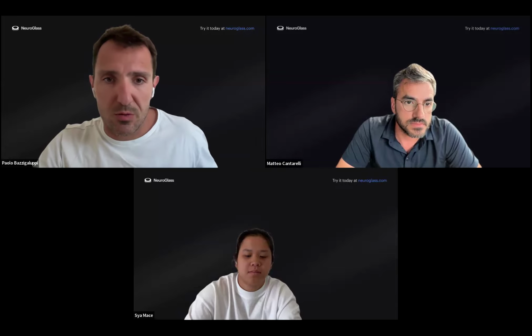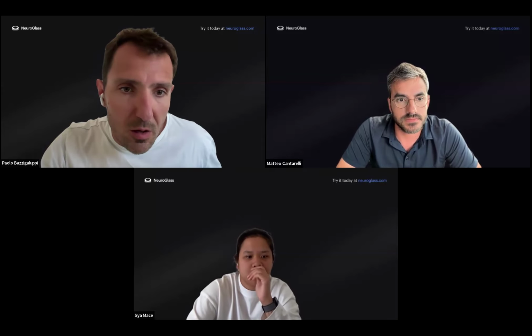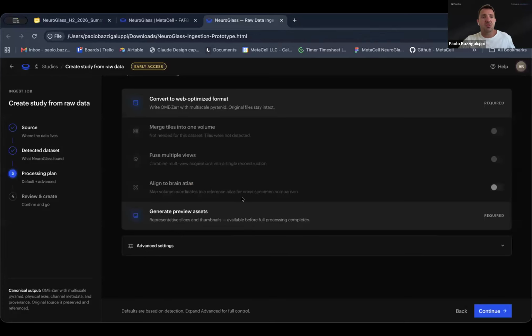What I want to talk about now is automated ingestion. You should see on screen what we think is going to be a distinctive feature of NeuroGlass. We know that large data sets are hard to import and manage.